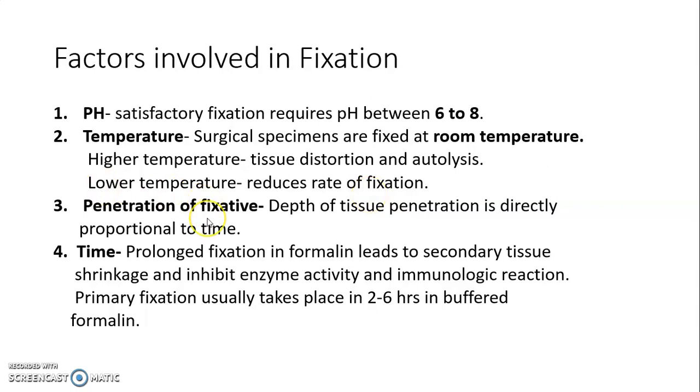Penetration of fixative is also important. Depth of tissue penetration is directly proportional to the time. Then duration. Prolonged fixation in formalin will lead to secondary tissue shrinkage and inhibit enzyme activity and immunologic reaction.